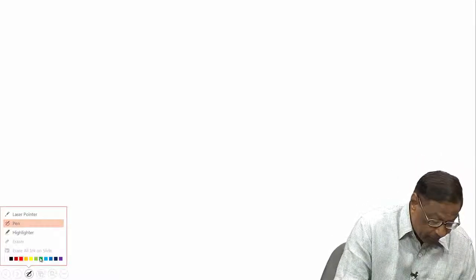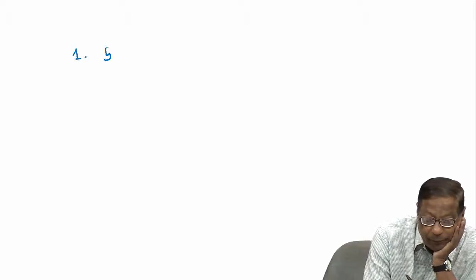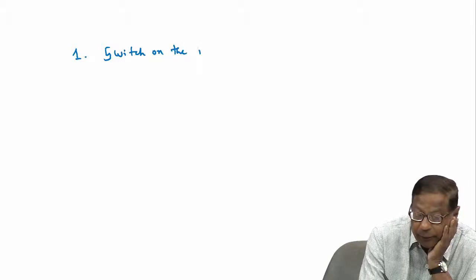So, the steps involved in atomic absorption are: number 1, switch on the instrument.